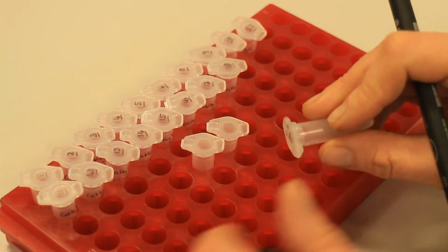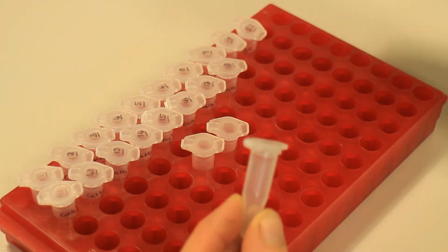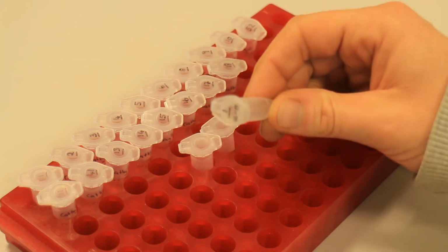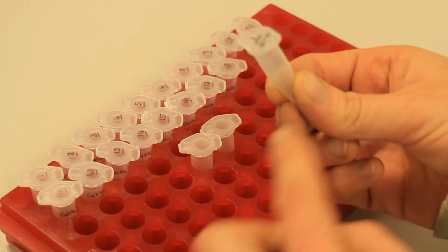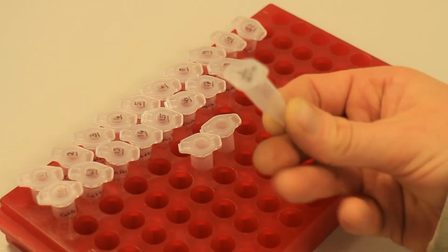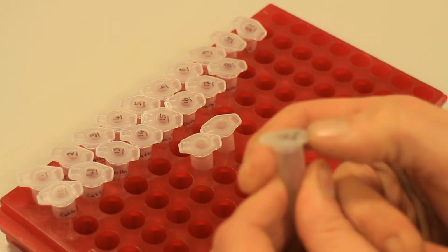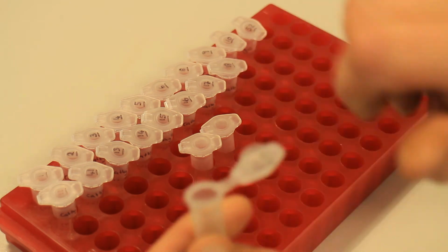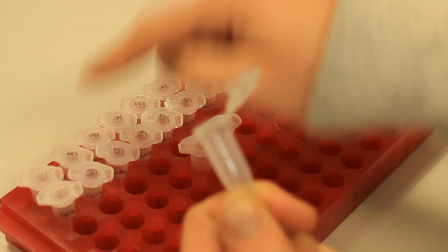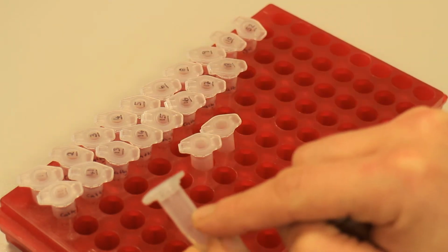but you also want to label them on the side, because if you put these in liquid nitrogen, you would want to punch a little hole in all the lids, because everything in there gets super cold in liquid nitrogen. And as you take them out and put them back into the freezer, -80 or -20, the air in here will warm up a little bit, because even -80 is warmer than liquid nitrogen. And air that warms up expands, and that sometimes makes the lids pop. And they don't pop like this, they pop completely. So you will lose the lid. And then if that happens with like 2 or 3 samples, you don't know which sample is in here anymore because the lid's gone, right? That's why you also want to put it on the side here.